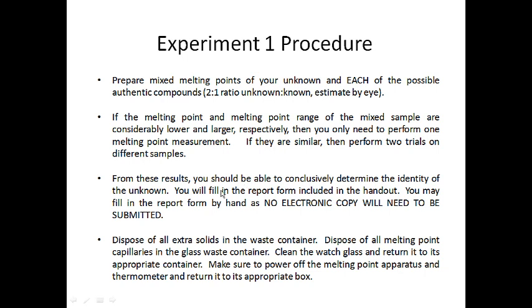The report that you're going to fill out for this is a report form that's included in the handout and is available on the Blackboard website. You can fill that report in by hand, or you can type it up, it doesn't matter. But for this experiment, there's going to be no electronic copy that you need to turn in. So if you want to print it out, you can just hand write it. During the experiment, all the data goes in your notebook. You're not filling out the form as your notebook, but you can fill it out later by hand if you desire.